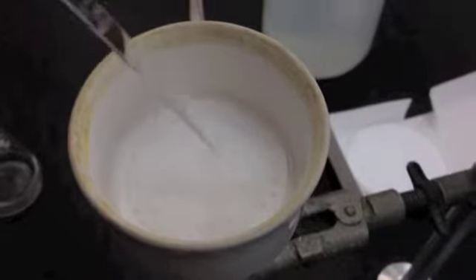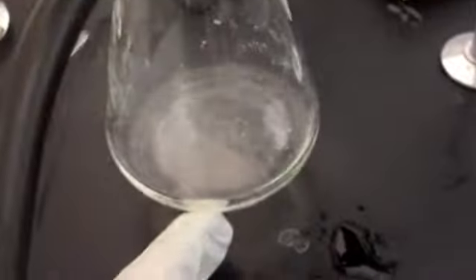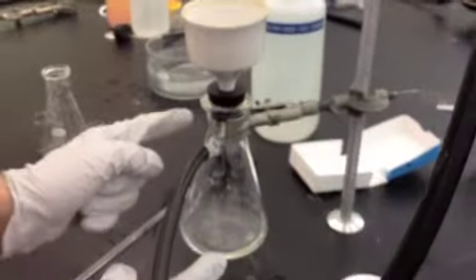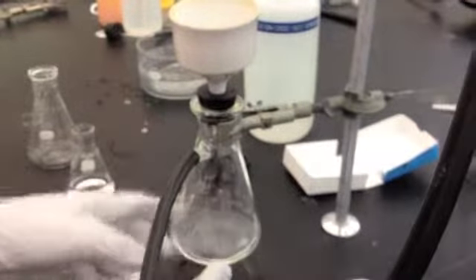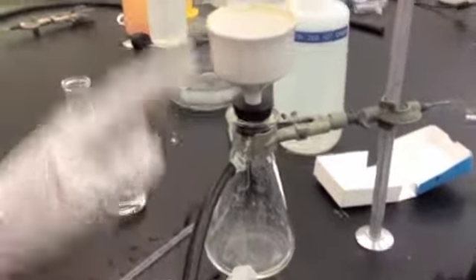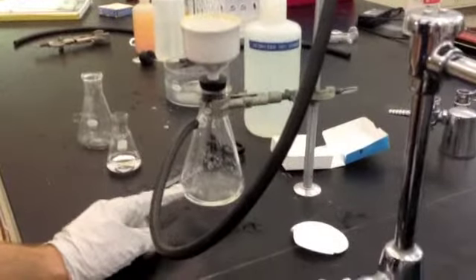We have some product here and all over the filter paper here. And we've got the solvent in here. Now you might also have some product that managed to get through the filter paper. In here, this is called the mother liquor. So what you can do then is take off your Buchner funnel and pour out your mother liquor into a separate Erlenmeyer flask, and then attempt to recrystallize it again and refilter it again to save some more of your product. Again, you need to make sure you have the solvent trap in between, otherwise when you turn that water off, it might back up right here into your mother liquor and then your product will be ruined.